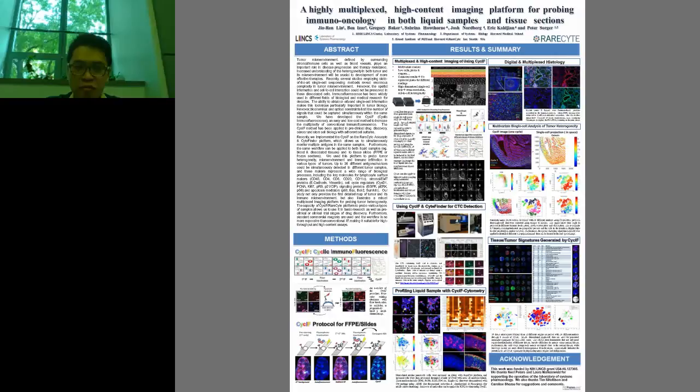But the first thing we just want to demonstrate is that it clearly distinguishes tissue from tissue. You can see each color represents one tissue, and after dimension reduction to plot into 2 dimensions, you can see the individual islands of different tissues. Also, in the middle part here, the red part is the tumor sample and the blue part is the normal tissue. Now you start to have the ability to distinguish the tumor and the normal tissue using this kind of technology.